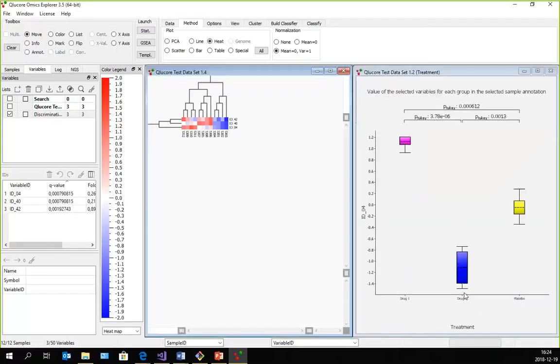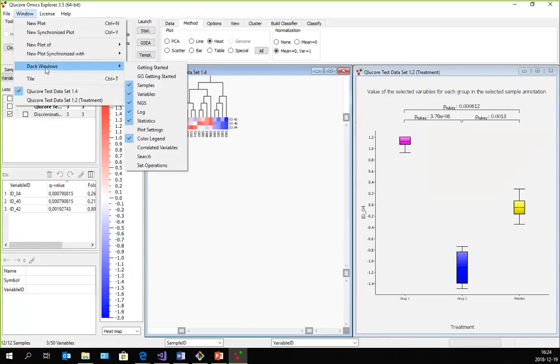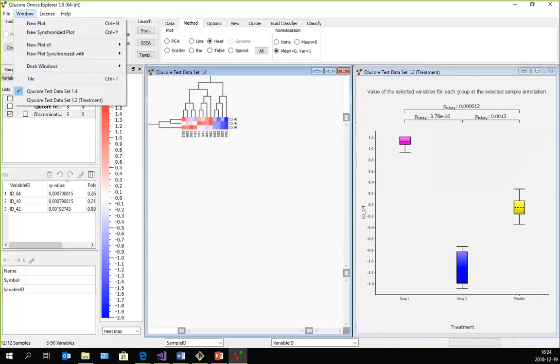So there we go. The test is performed. And the statistics window was brought up. However, I think it ended up on my other screen here. Or maybe it... Let's see where it is.